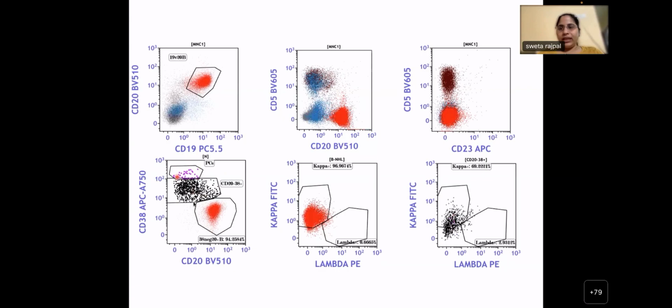So we see a trend of this CD19, CD20 bright population of lymphocytes maturing towards plasma cells. And in the bone marrow aspirate morphology also we had seen that the cells were lymphoplasmacytic cells with few plasma cells. So with this history we actually think of lymphoplasmacytic lymphoma and not multiple myeloma.